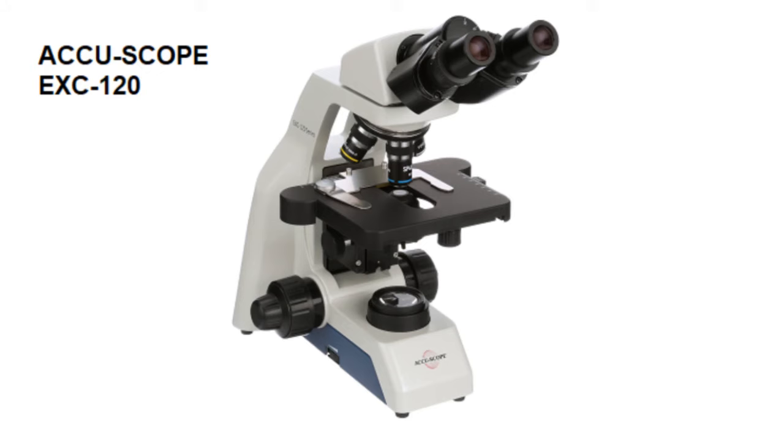This microscope is great for educational purposes as well as entry-level laboratory applications. So let's get started.